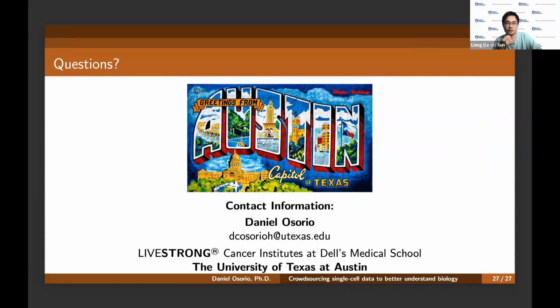Got it. I think Ashish has a follow-up question. Even though you answered his question, he basically asked whether you have checked the thresholds for the dead cells and doublets. Yes, we did a linear regression analysis to identify the 95% confidence interval of the prediction. So we removed everything above and below that range.